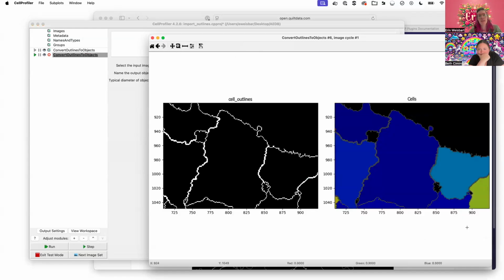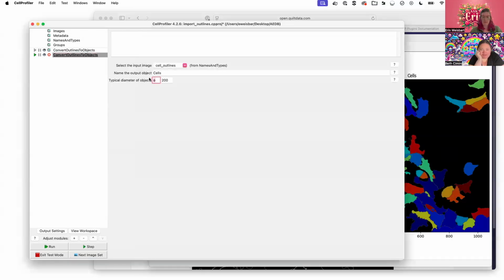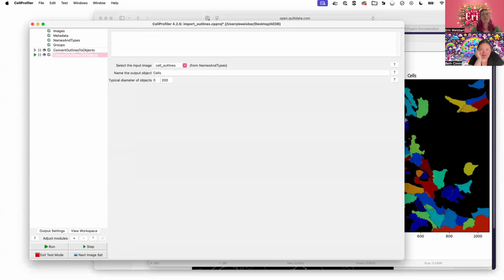One could expect that if we zoomed in, it might think this little object here is an object, but it actually did a great job of figuring that out. But playing around with these, is that why I pressed O instead of 0?